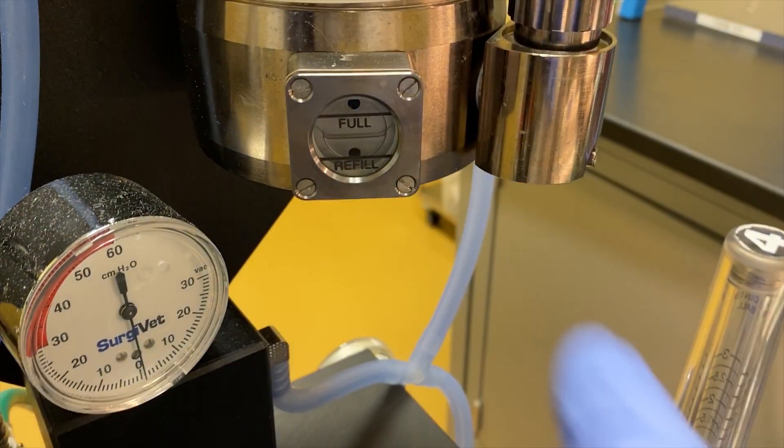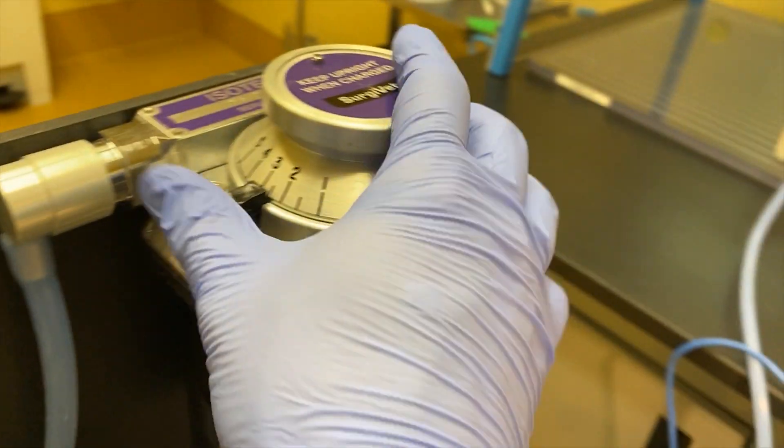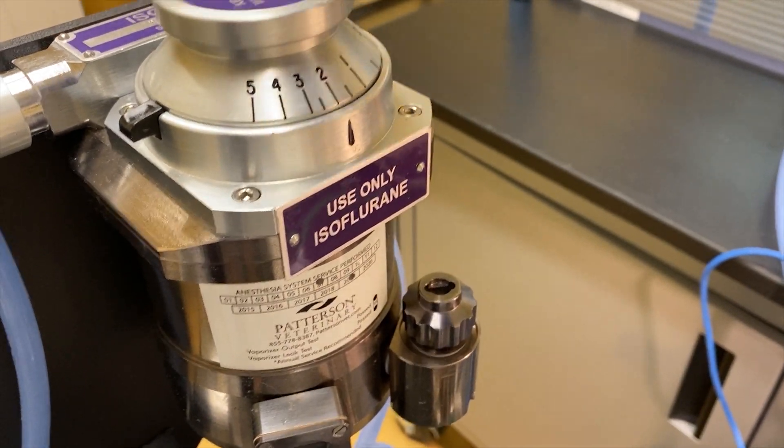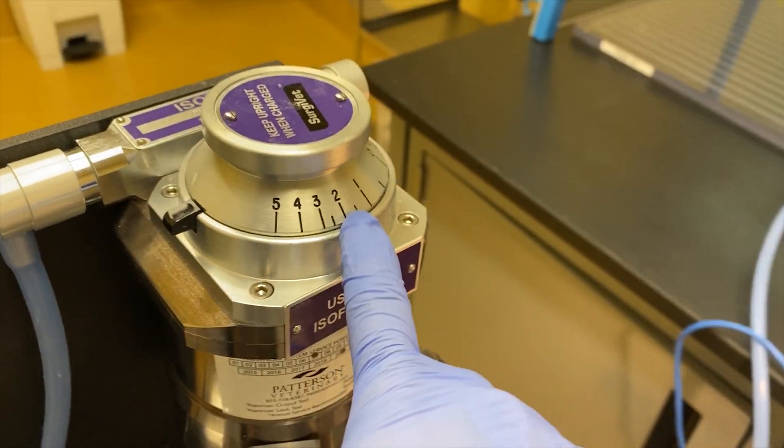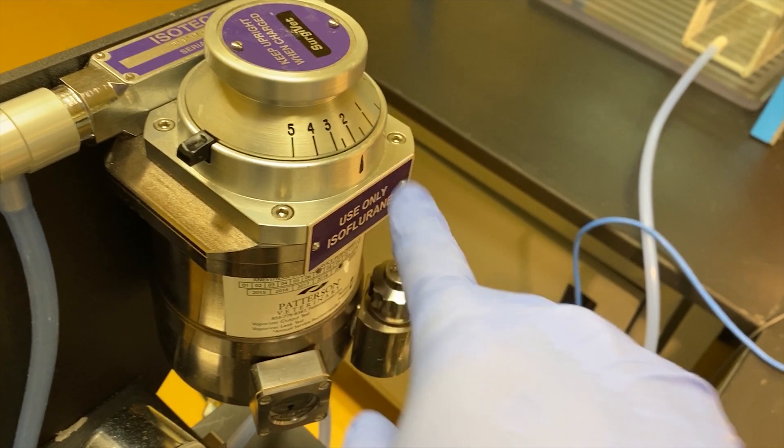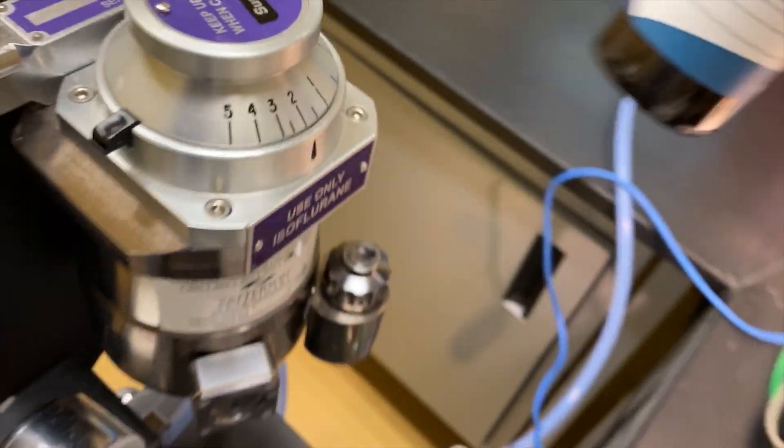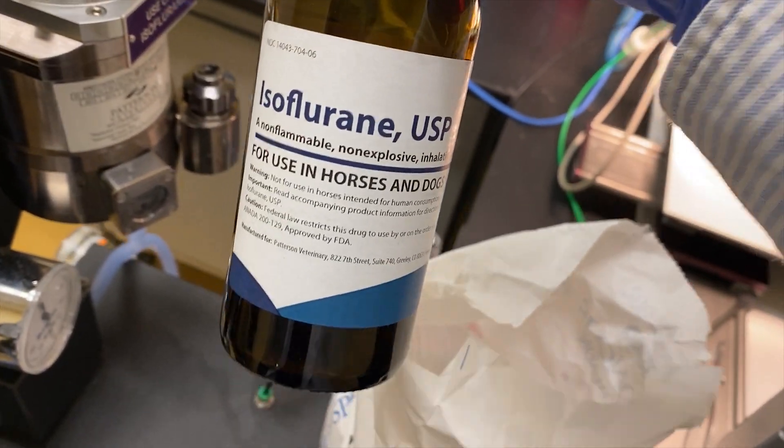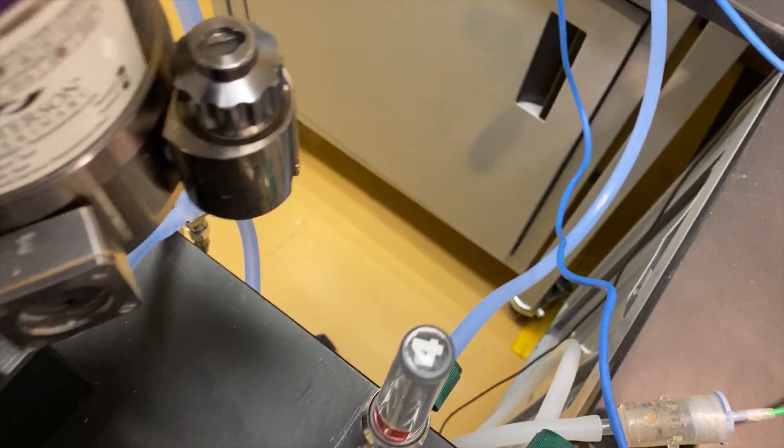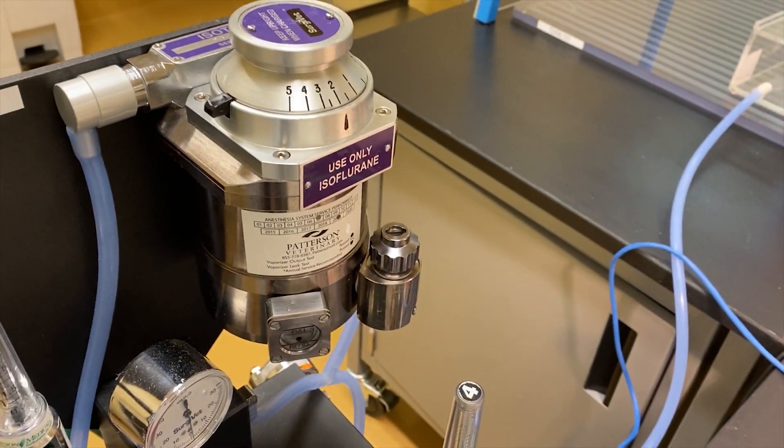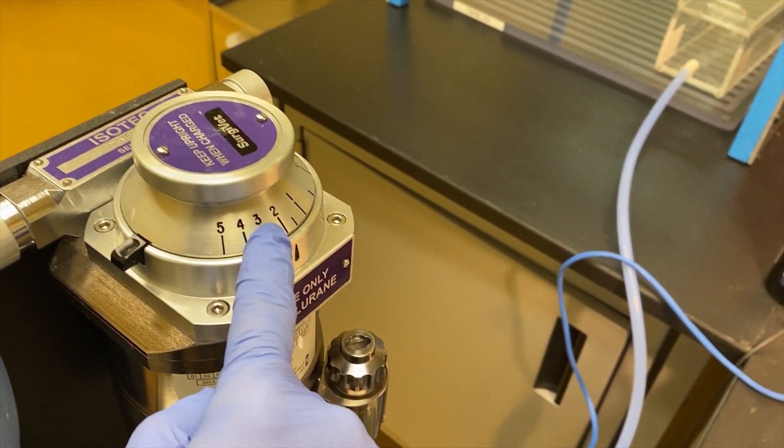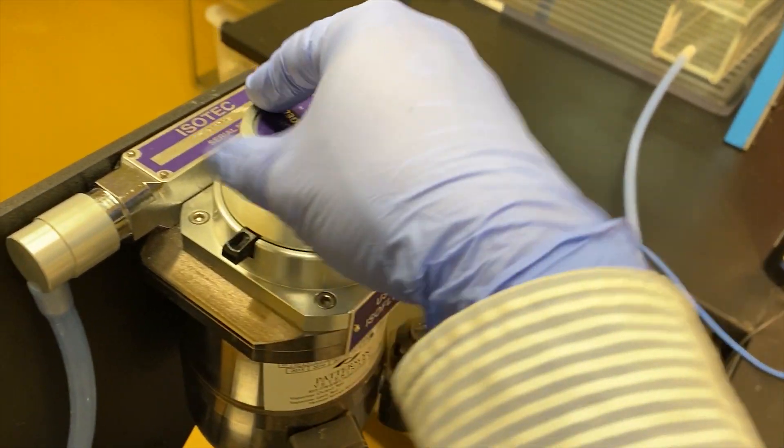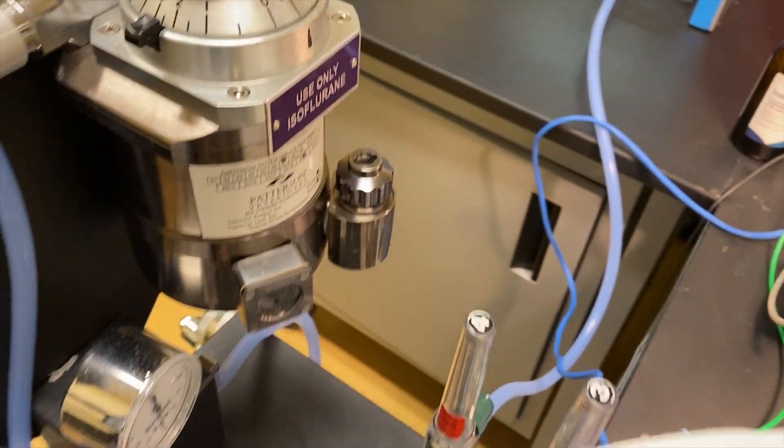And open this device. Most of the time, I will use 2%, so because the isoflurane will affect the mouse heart rate, so the lower is best. So most of the time, I will use 2%, close it.